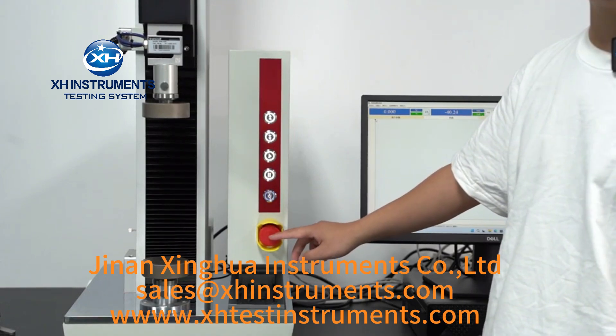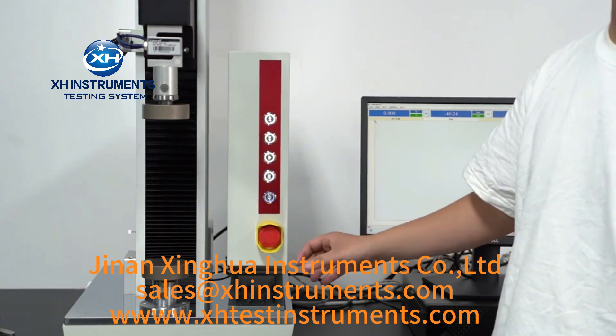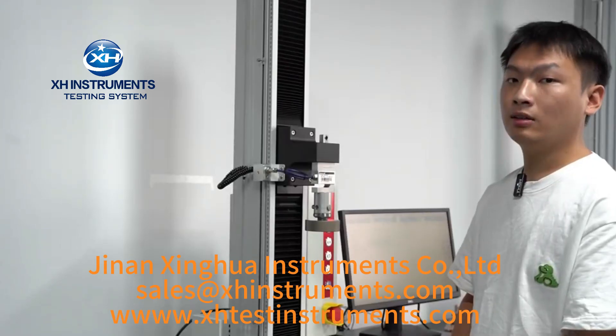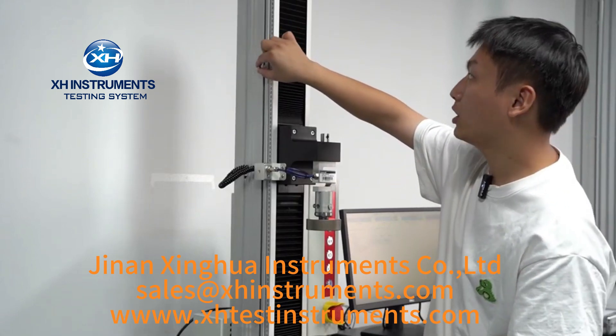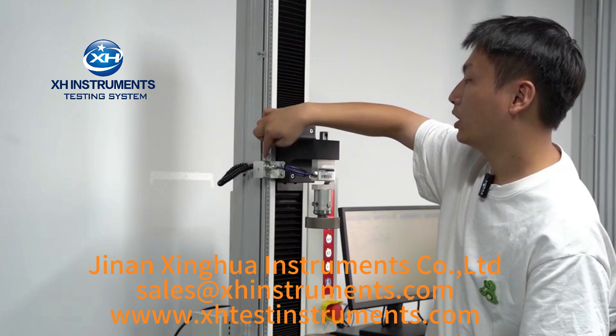It should be noted that the device is equipped with a red emergency stop switch. In case of any emergency, simply press this button and the device will immediately stop running. In addition, a limit switch is installed on the left side of the rack to prevent accidental collisions between fixtures during the movement of the crossbeam.